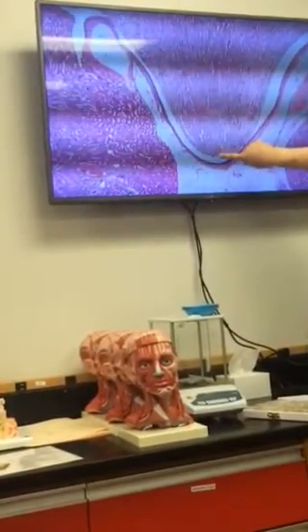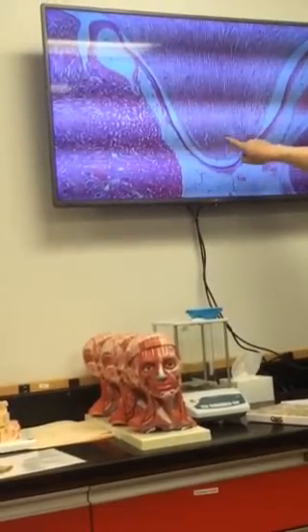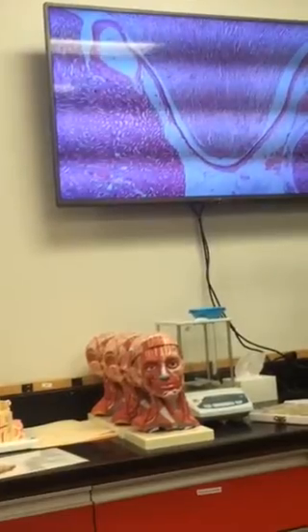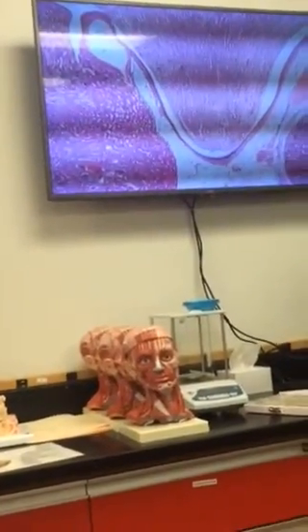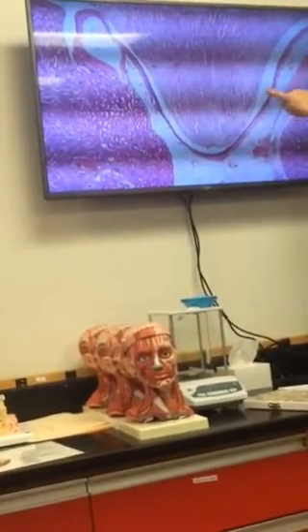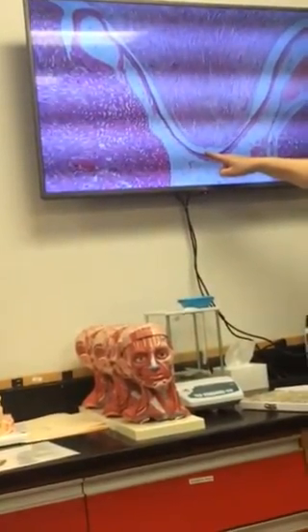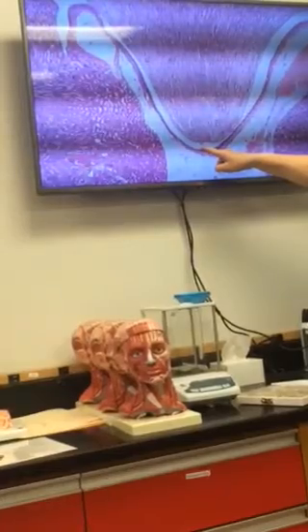In fact, isn't that one right there? Yep. Looks like it right there, and that would be a collecting duct. That is collecting urine from a number of different nephrons and then running it out into, what's this cavity or space right there inside the kidney? That would be the renal pelvis right there, okay?